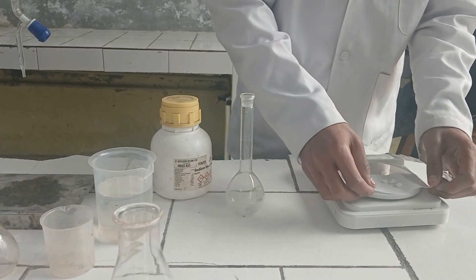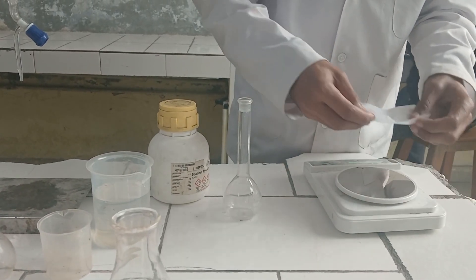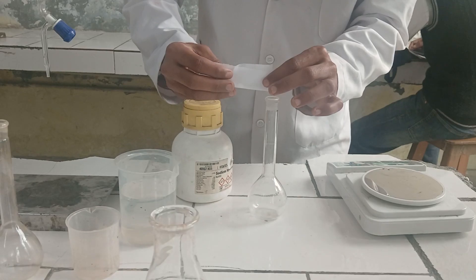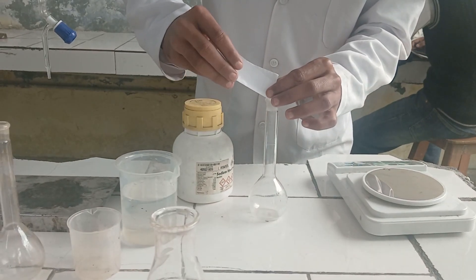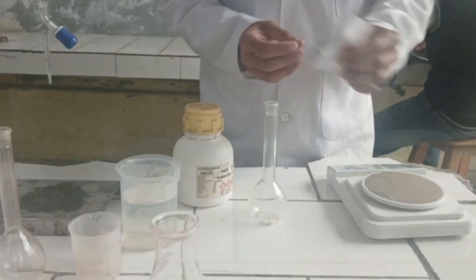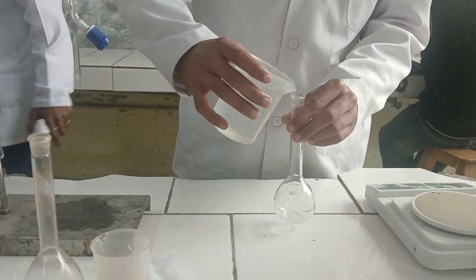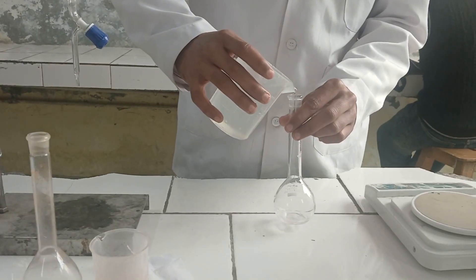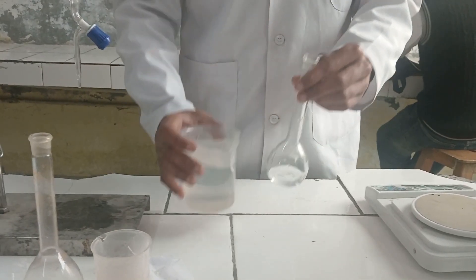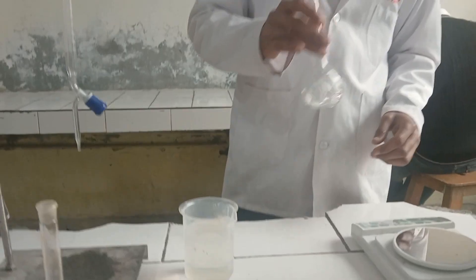You know that sodium hydroxide is hygroscopic in nature. So, we have to transfer it to the volumetric flask. Make up the volume up to 100 ml. Firstly, dissolve it completely until all the pellets get dissolved. So, we will vigorously shake it.